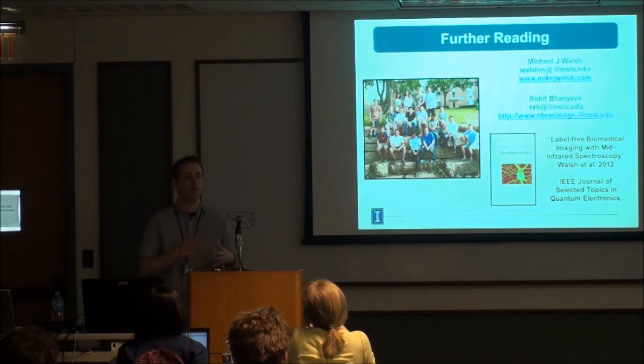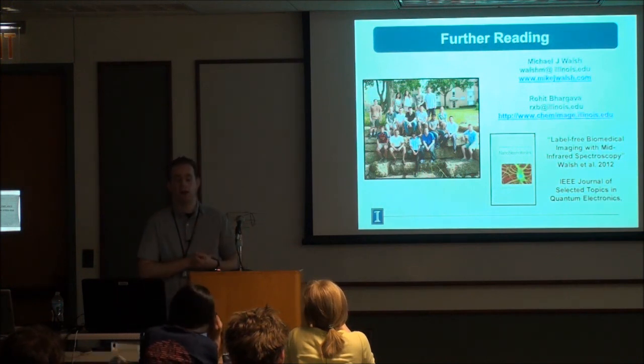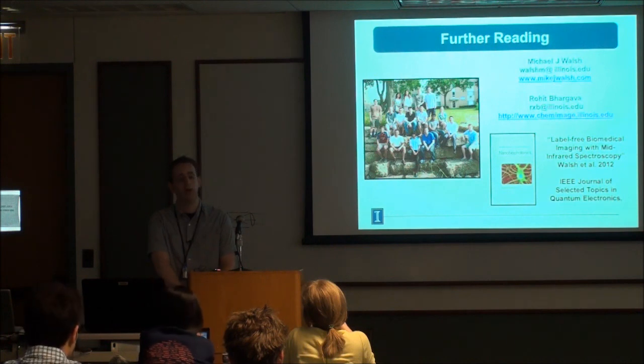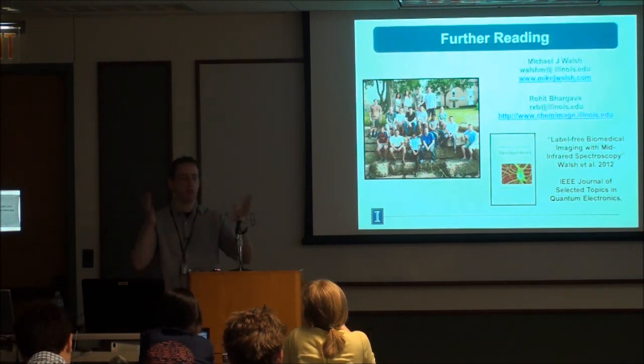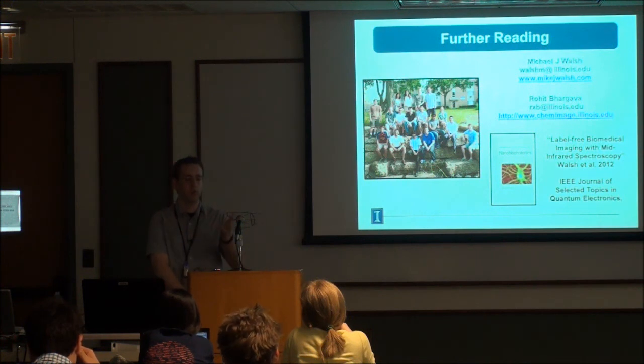Typically, if you're imaging for an hour or so, for the atmospheric correction you'll take an absorbance background and then scan your sample, and that'll correct primarily. There's also a couple of correction algorithms. For anything where you're scanning for long periods of time, yes, it's better in an enclosed atmosphere. So we have an FTIR over at the hospital at Mills, and that's fully enclosed. But yeah, it's typically okay if you don't get too much atmospheric change within a few hours, but not over even a month.